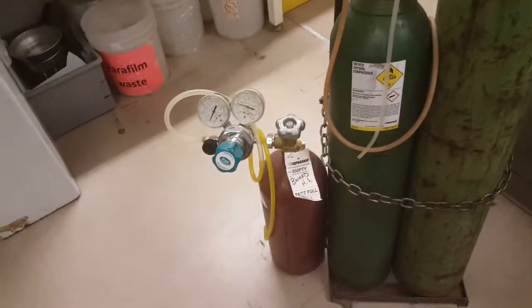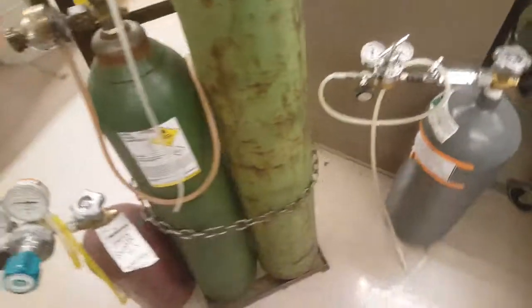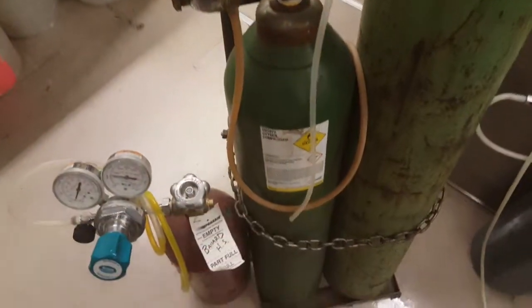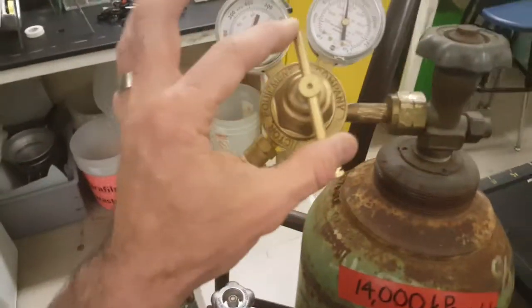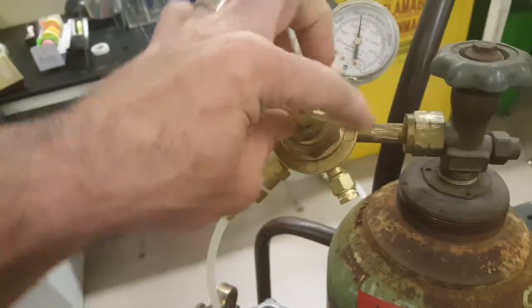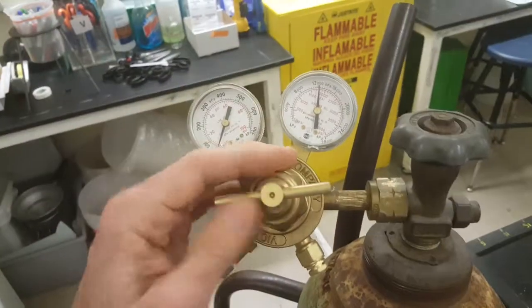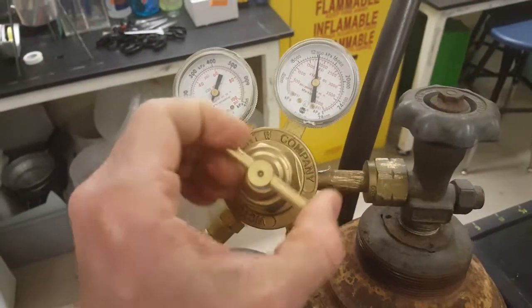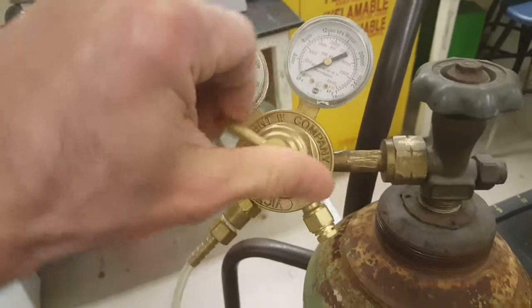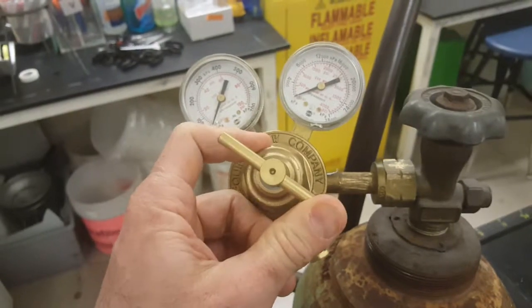The other gases are over here. We've got oxygen, we've got hydrogen, we've got some carbon dioxide, which we might run out of today, or maybe we'll run out of the oxygen, we'll see. But with all of the gases that we have, you've been taught your whole life righty-tighty, lefty-loosey. So it should be righty on, lefty off. Or righty off, lefty on. I just confused it myself. But regulators are different. Righty turns the gas on, and then lefty turns the gas off. That's a tricky part.